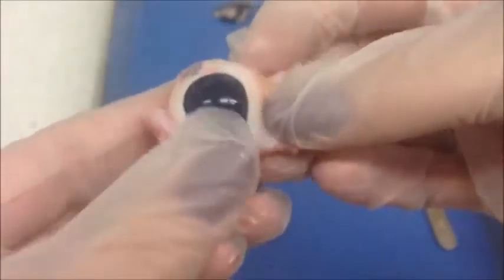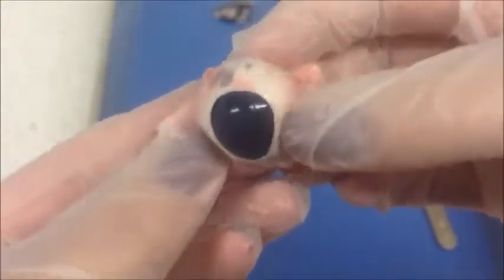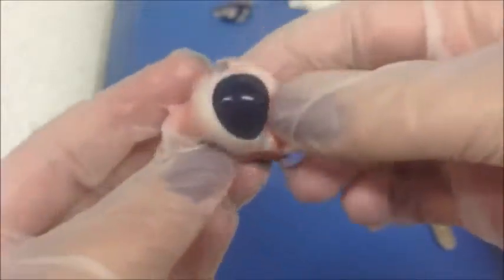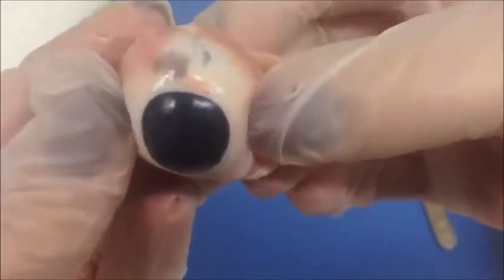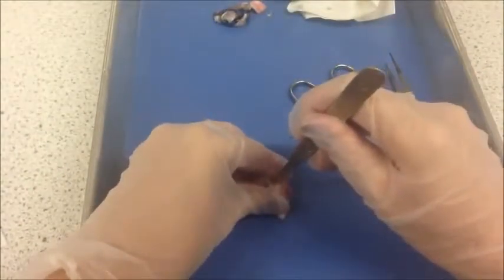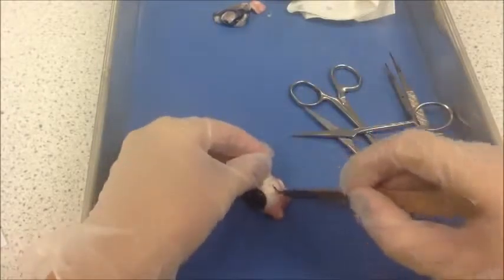If I turn the eye around, you can see the optic nerve leaving the back of the eye. This nerve carries a lot of the visual information the eye is collecting and sends it straight to the brain to make sense of it. I'm now going to cut the eye in half with a scalpel, straight down the centre, so we have the back of the eye and the front of the eye.